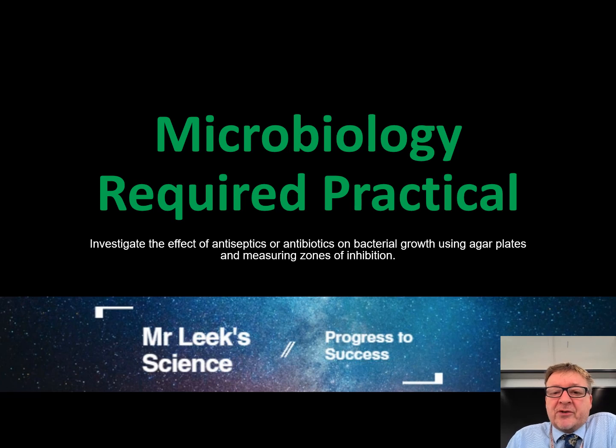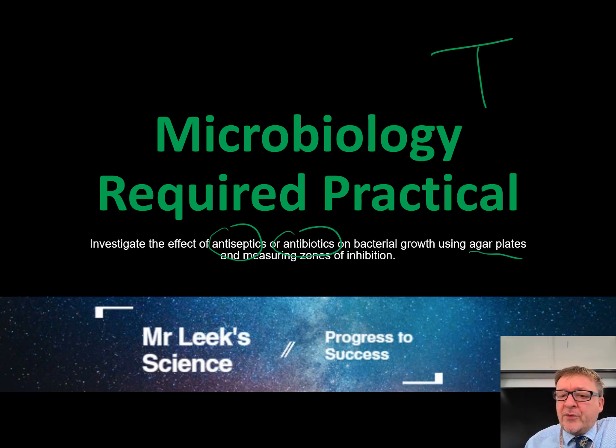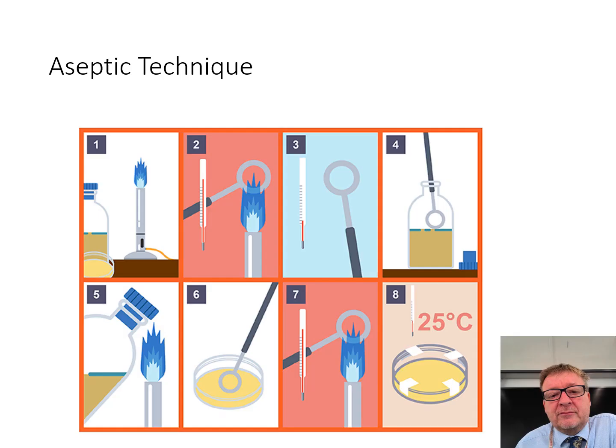So this is the microbiology required practical. Again, it's triple only. And the whole point of this is to investigate the effect of antiseptics or antibiotics on bacterial growth using agar plates. And the whole thing that you're measuring is something called the zone of inhibition, that I will go through in the actual practical itself.